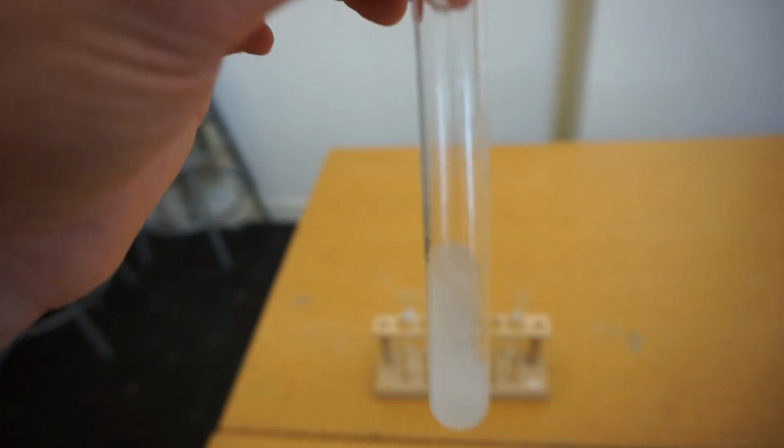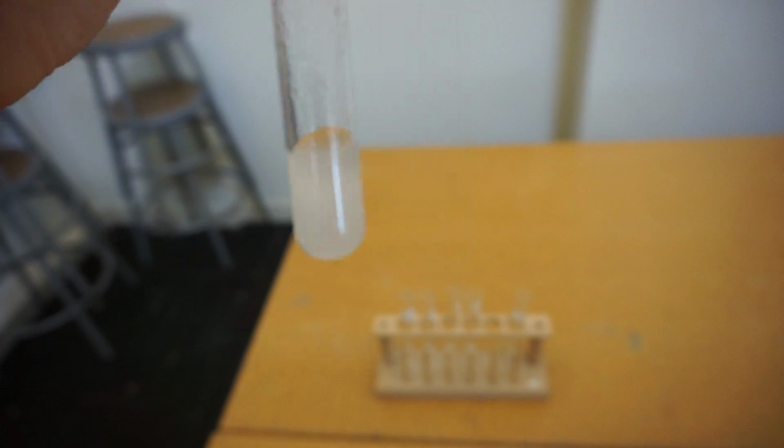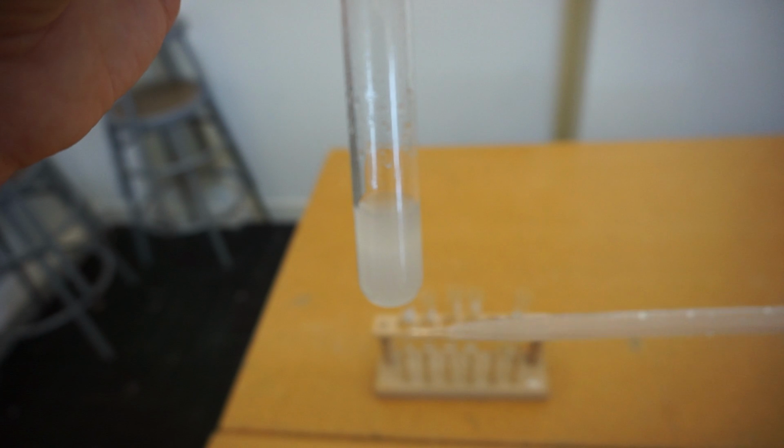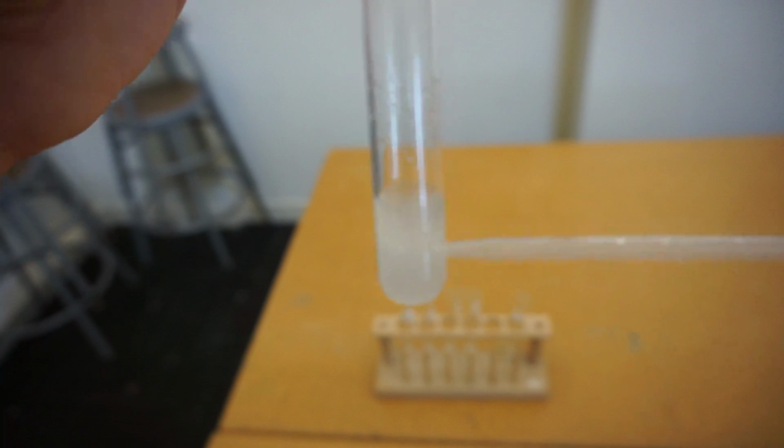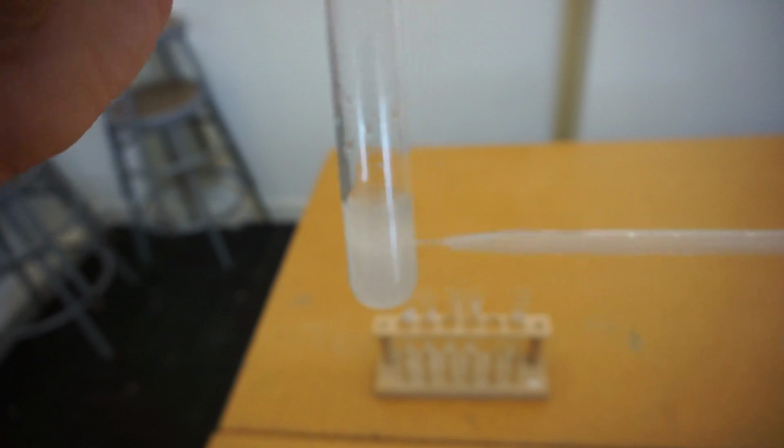With pentanol, we'll probably expect to see the same thing again, so we'll just check. Again, we see the cloudiness, and we're going to see pretty quickly starting to separate and an interface between the two liquids appearing.